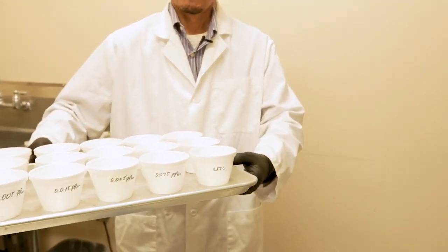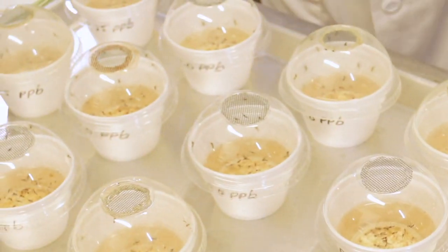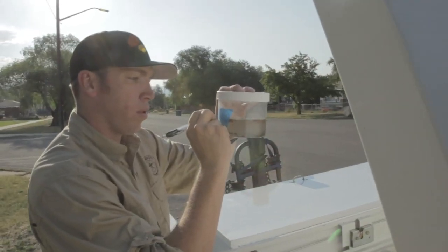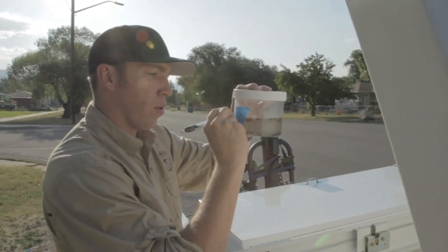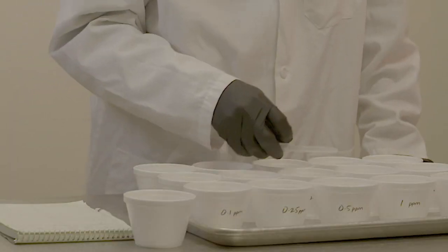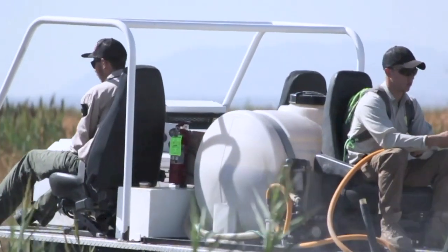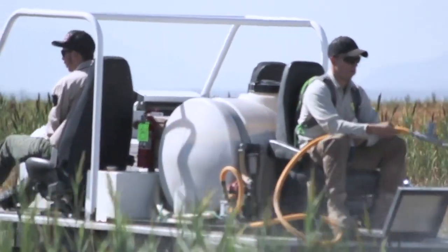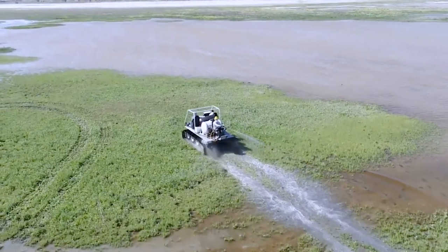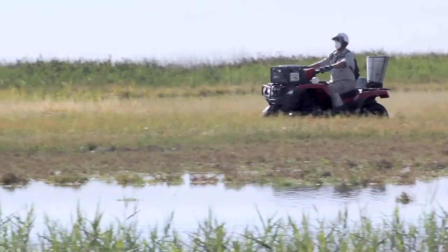Bioassay, a simple, straightforward process to quantitatively measure the interaction of a lethal agent versus a target organism, is an important tool for multiple purposes, ranging from resistance detection and management, active ingredient screening, commercial product evaluation, studies on product stability under harsh conditions, and the efficacy of particular formulations of mosquito control agents in the diversity of larval developmental sites in your district.